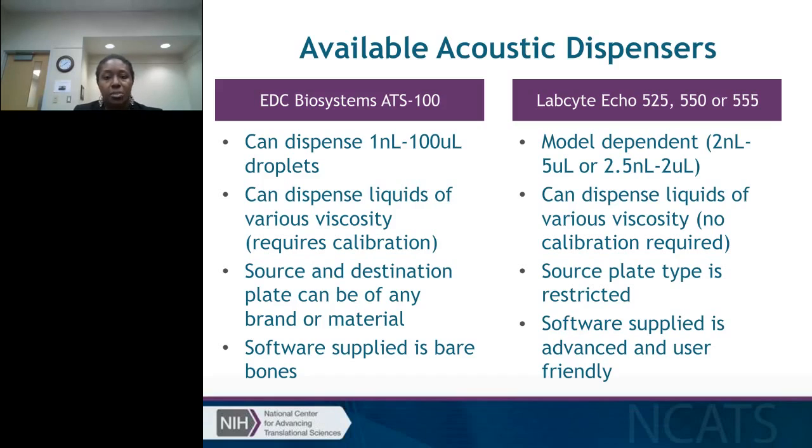They both can dispense various sizes of droplets, and they both can also dispense liquids of various viscosity. So if your compound is suspended in something that's not DMSO, let's say it's suspended in water or glycerol or something like that, the acoustic energy required to transfer something in DMSO is different than needed to transfer a liquid that is of a different viscosity. And so both of these instruments can do various liquid viscosity.